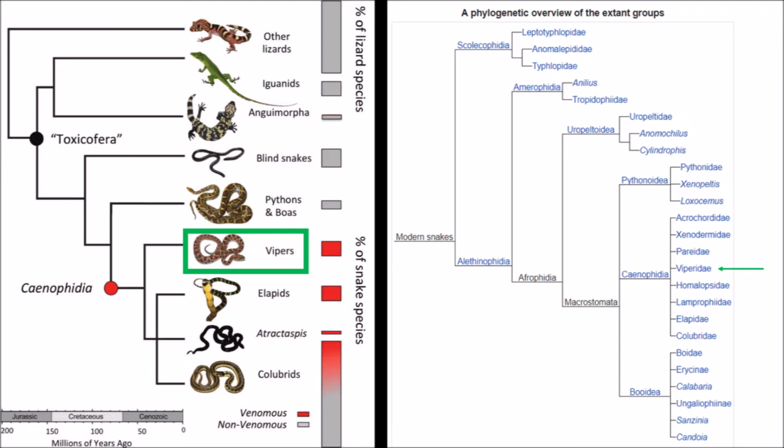The other clade, which branches down and then goes off again, is the Colubrids or Colubridae, which is known for its members having rear-facing fangs. And this is where our non-venomous snake belongs. It's also worth noting that not all colubrids are non-venomous. Approximately 50% of colubrids are considered venomous, and the rest just have regressed venom systems.